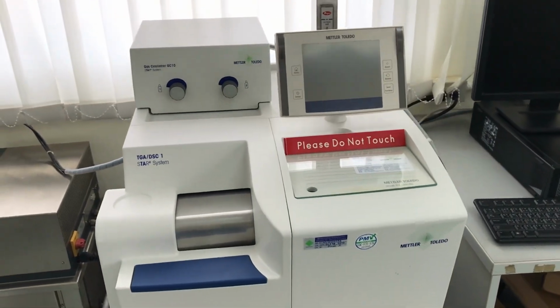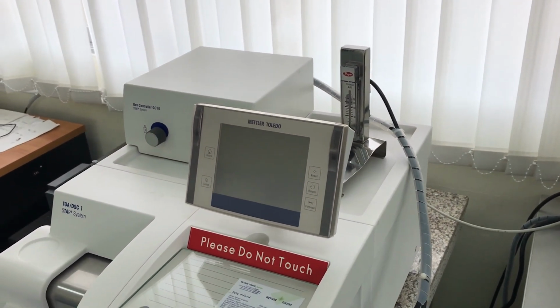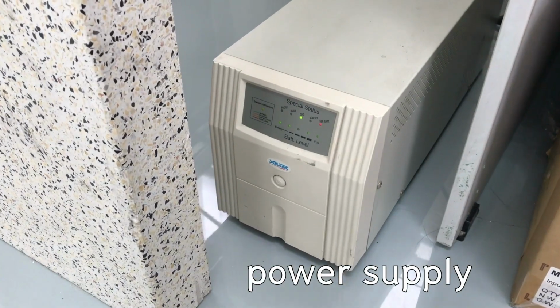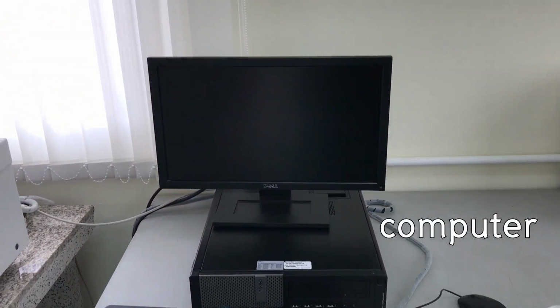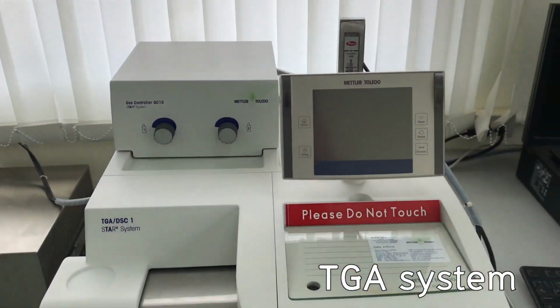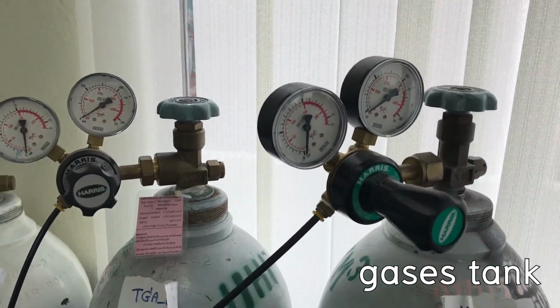This is thermogravimetric analysis machine. The TGA gives the information of thermal characteristics of fuel. The system consists of 5 parts: power supply, computer, TGA, cooling unit, and gas tank.